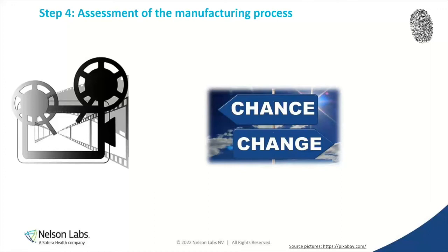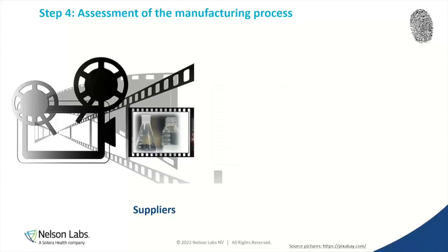So now this is a lot, again, of work done in the manufacturing facility by the customer. So really thinking about what is my process. And I would say, if you're automatically saying, my process hasn't changed in 10 years, I would say you probably need to go and ask questions about what has actually changed. It may not have made it to the level of somebody saying, oh, this is an actual change. So we're going to talk about some of those today to help you ask really good questions. Lisa and I are going to make you really good investigators after this today, not just for cytotoxicity, but for everything.